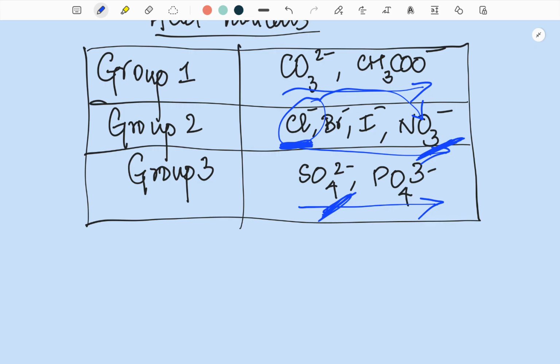If you are not getting a positive reaction for the chloride test but you get a positive reaction for the nitrate test, then there is no chance that it is chloride, because if the ion were chloride, it should have given a positive reaction for the chloride test as well. I hope I'm making sense.